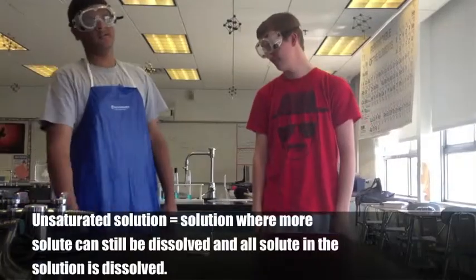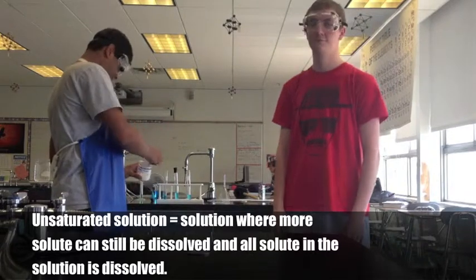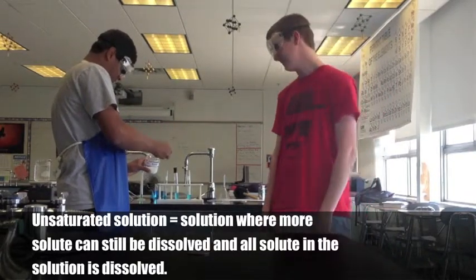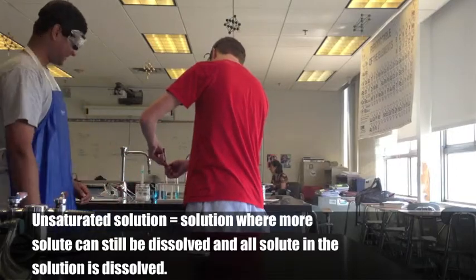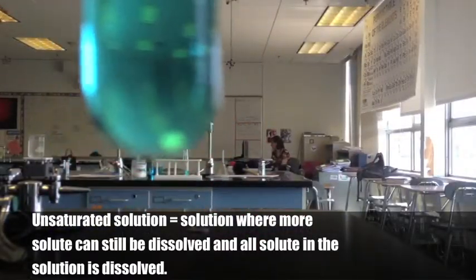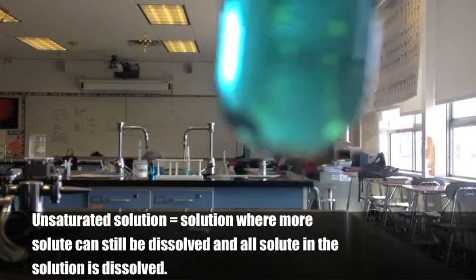Now we will be making an unsaturated solution. I am the one who pours. This is an unsaturated solution because, as you can see, after mixing it thoroughly, there's no solute still undissolved.